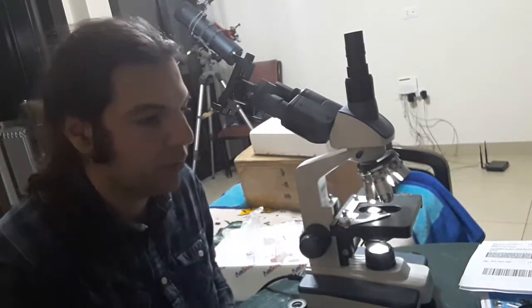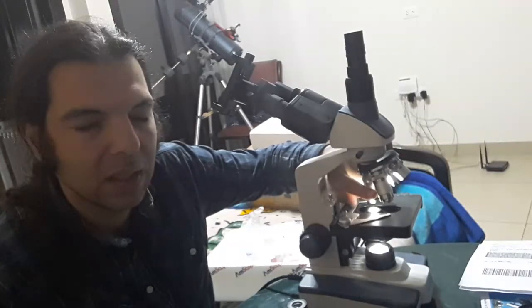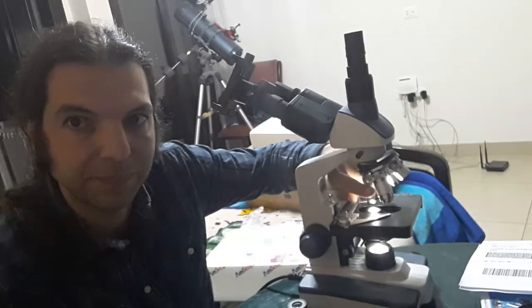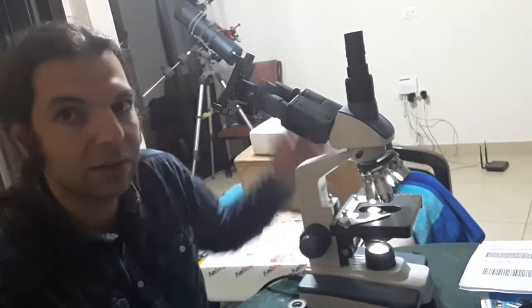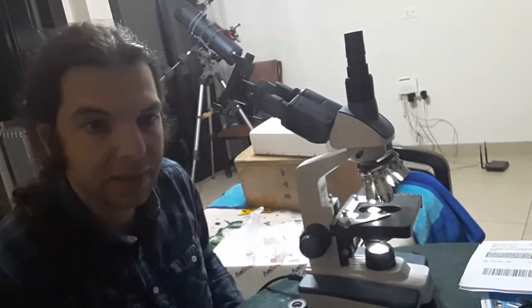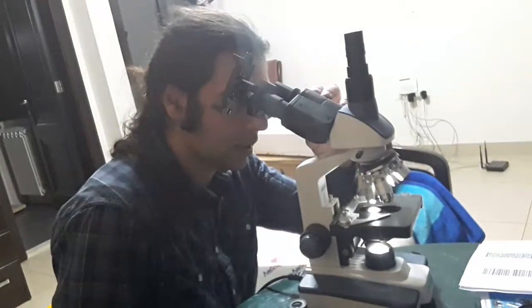You can reach up to 5,000x magnification if you use the 100x objective lens with a 50x eyepiece — I haven't bought that lens yet but will soon. This is a trinocular microscope, so you can use it with your eyes and also attach a camera.